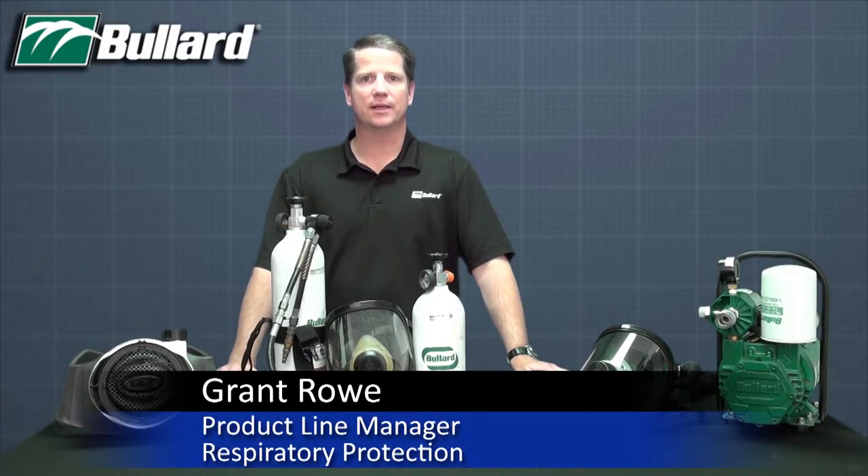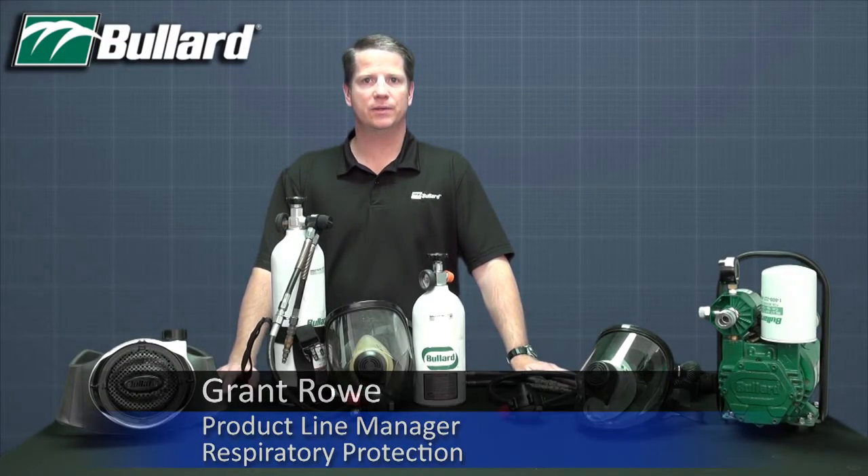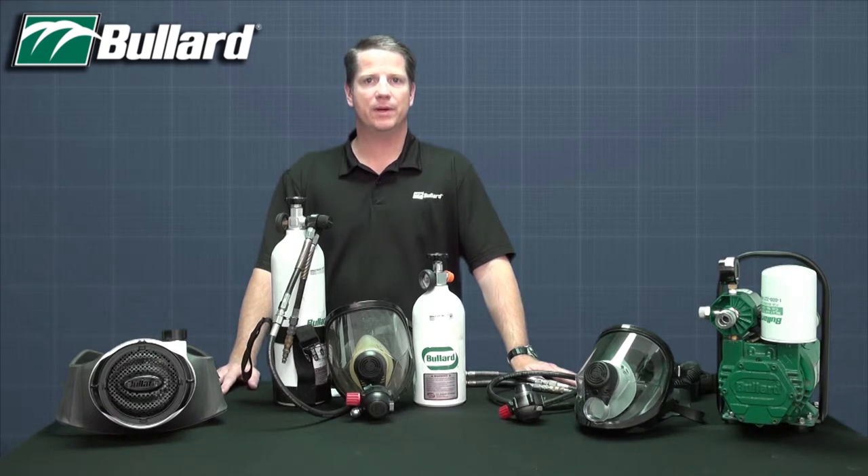Hello, my name is Grant Rowe and I'm Product Line Manager for Respiratory Protection at Bullard. Today I'd like to share with you about our Spectrum Series Full Face Mask Supplied Air Respirators.